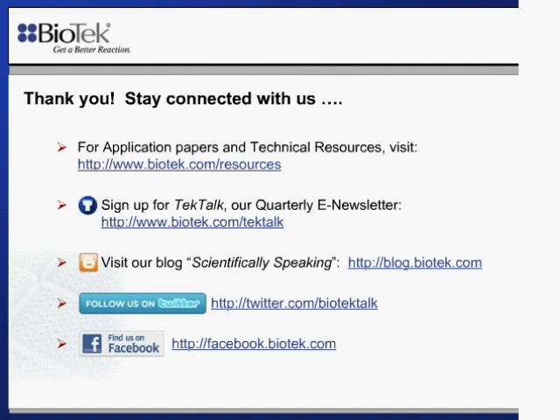Within Gen5, you can certainly control what reference value or what reference wavelength you want to use. So you can certainly do a 260/230 ratio. I didn't touch on that here, but that is certainly something that can be determined, as well as using a spectral scan of your protein or of your RNA samples, to get as much information as you can, and then you can certainly use other reference values as well.